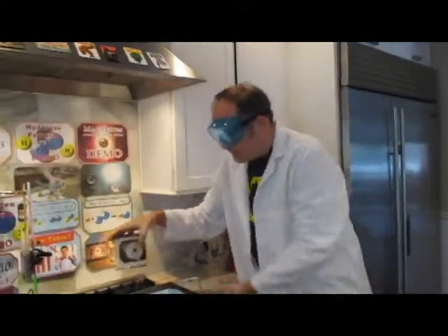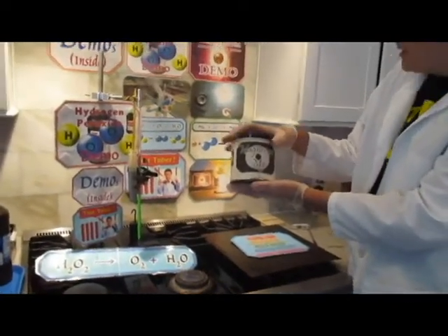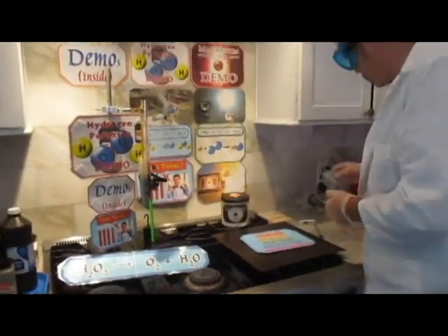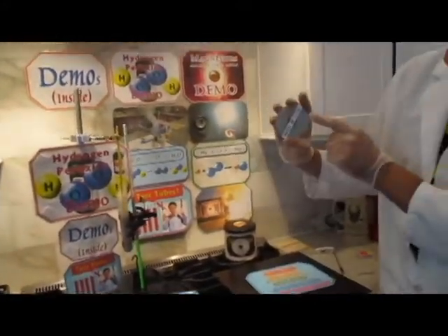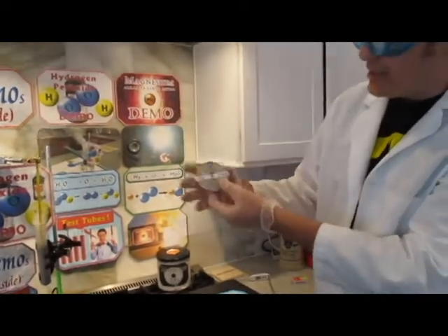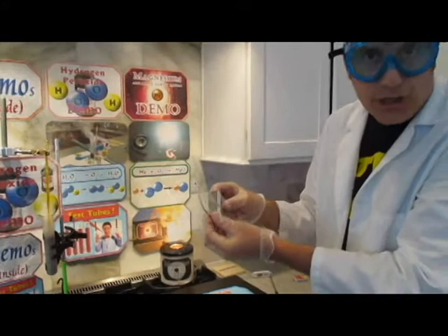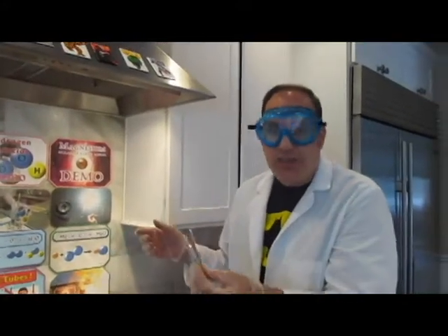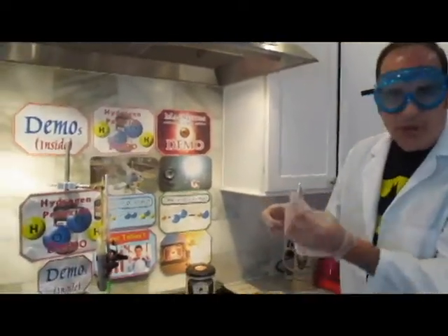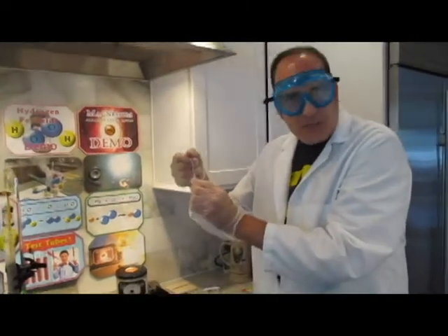Okay, magnesium is an alkaline earth metal. Magnesium is an alkaline earth metal, and it usually comes in ribbons like this. Okay, we find that the good stuff, for some reason, comes from India now. This is a ribbon of magnesium. Remember, metals are malleable. Metals are ductile. So you can make them into wires, and you can make them into sheets. Well, guess what? A ribbon is a little bit of both. It's almost as thin as a wire, and it's as flat as a sheet. So here's a little piece of magnesium metal.